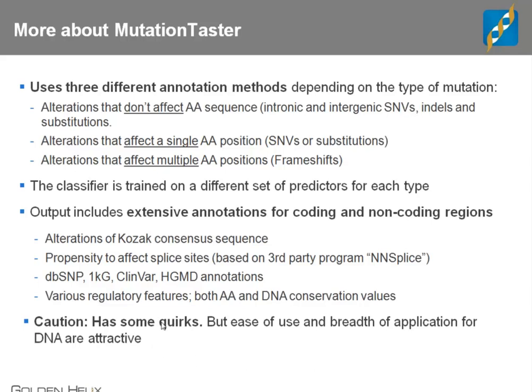It does have some quirks, and I won't go into too much detail, but for example, I've seen that the web interface gives a few extra variables that you won't get from the batch system with VCF files. I ran a few example VCFs through where it seemed like output may have been truncated in some of my results.